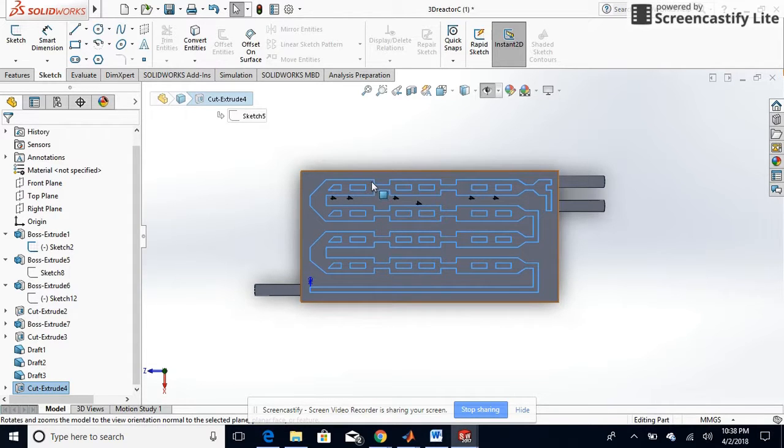We'd get bubbles, and we couldn't get those out with a really narrow channel diameter, as well as many of them. So we had one reactor that was pretty complicated, maybe had like 40 or 50 of these corners, and it was only 1 millimeter in diameter. And we couldn't get the bubbles out, and it really decreased our volume, and it probably destroyed the performance of that reactor. So we learned from that, and this is the design we came up with.